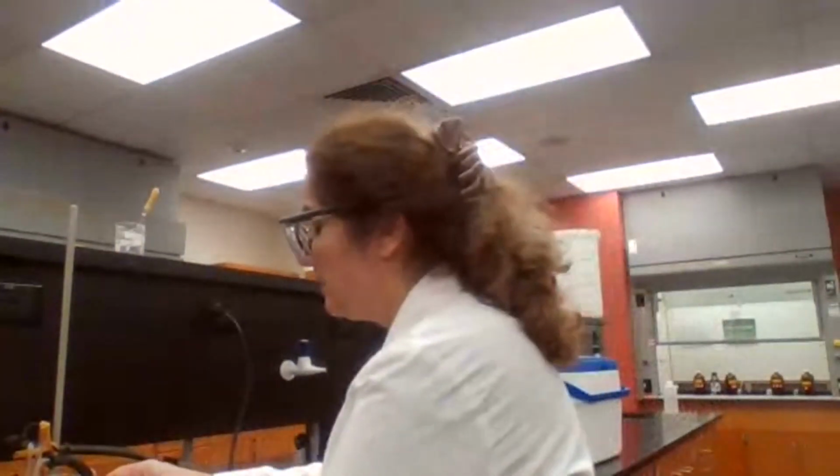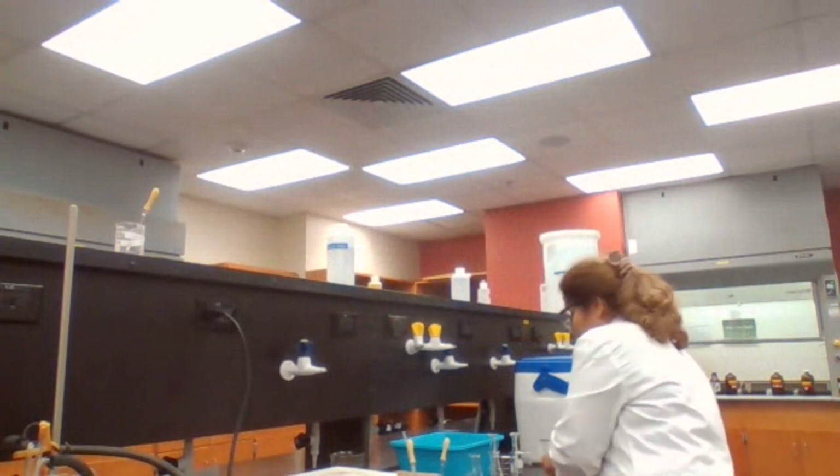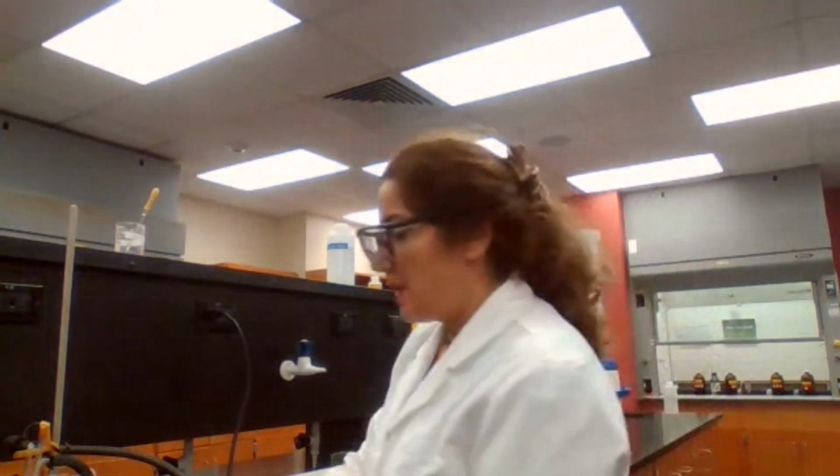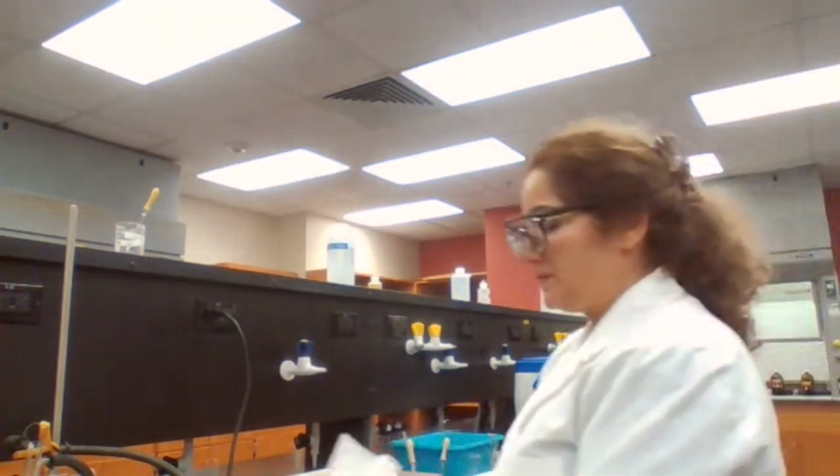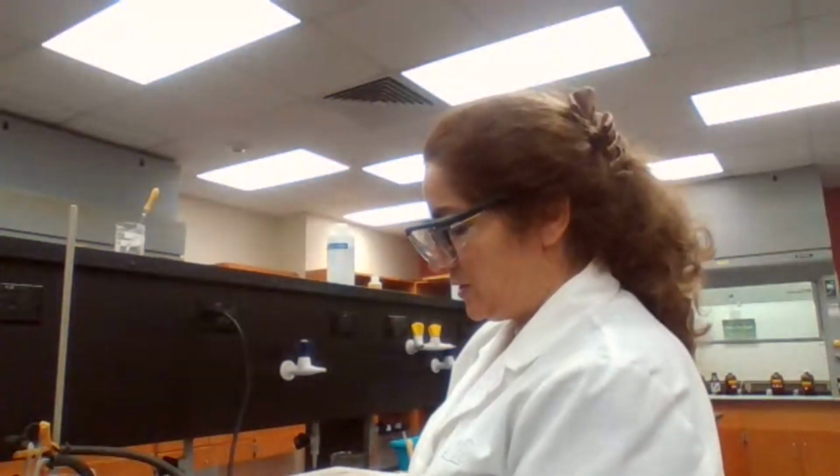Because we continue the vacuum for 5 minutes. 3, okay, wait for 2 more minutes. Then we place in the oven. Okay, going to turn off the vacuum and try to get the sample. Place it in a watch glass.